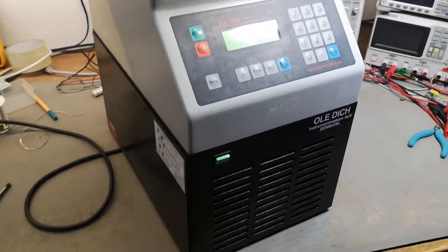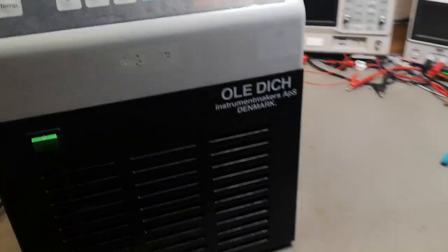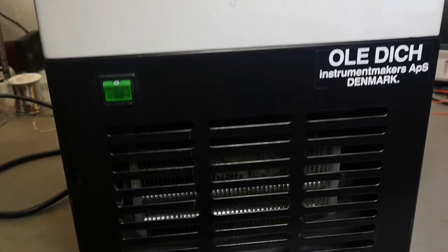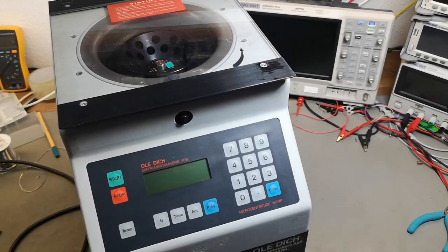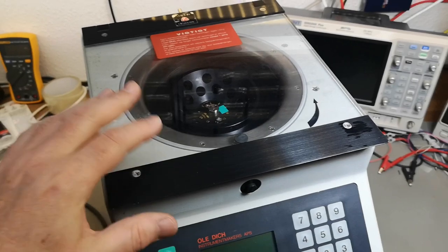There's a compressor cooler down here with a big nasty fan and a compressor unit and all that kind of stuff. The whole unit is 30.5 kilograms and I still haven't figured out how to open the lid.